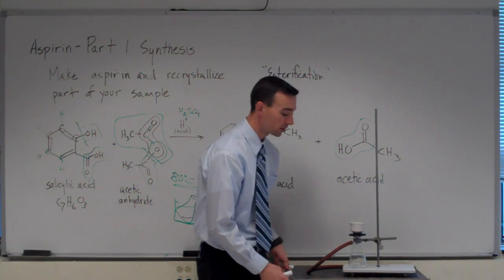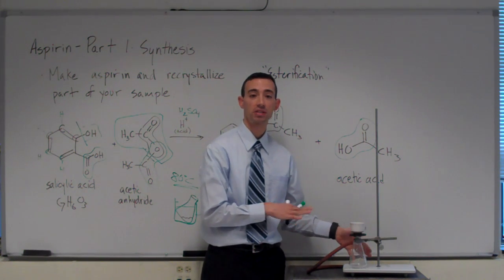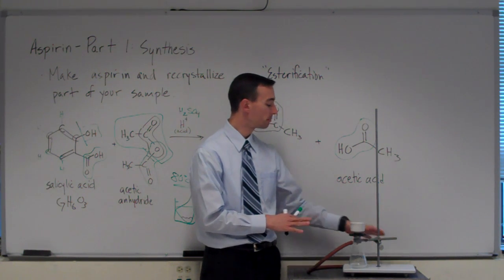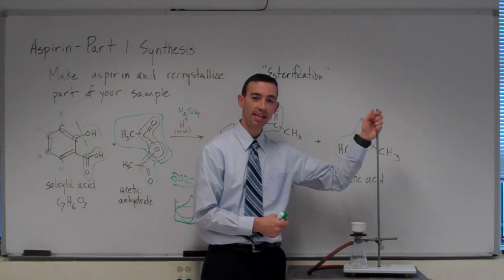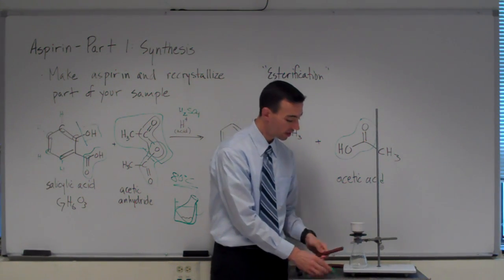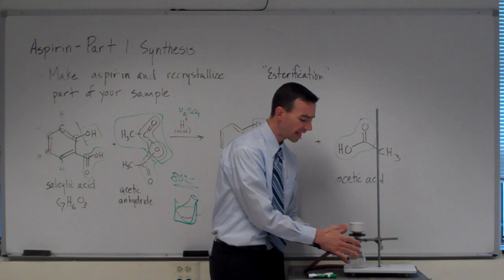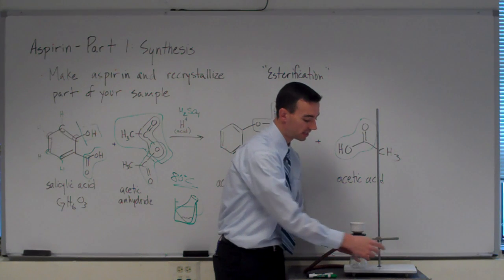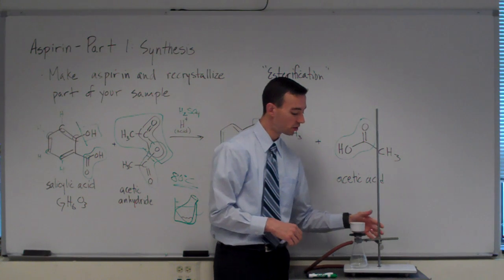Let me wheel one in here. Please remember, when you're setting up a filtration apparatus, a couple of safety points to keep in mind. First, you're going to do this in the hood because our vacuum apparatus are set up in the hoods. At the back of the hood is where you find the vacuum line controls. I've used a ring stand to clamp my filter flask, which is the type of flask with the side arm on it, to the ring stand. This keeps the flask nice and stable. If we didn't have that clamped tightly, it would definitely be susceptible to falling over while we're working with it. So quickly clamp it into a ring stand.